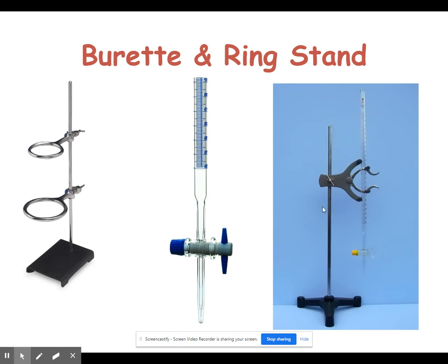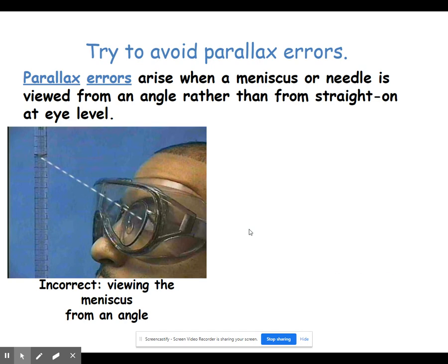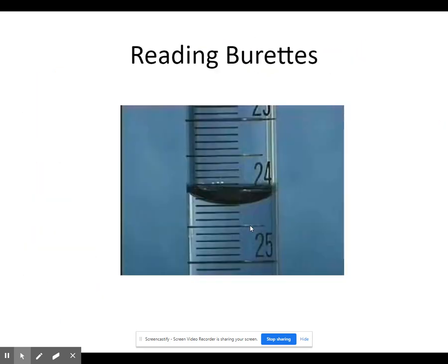The stand that holds the burette is called a ring stand if it has a ring on it. One important thing about reading a burette: the markings on a burette start with zero at the top, and the numbers get higher as you go further down. This is the opposite of a graduated cylinder, where zero is at the bottom and numbers get larger as you go up. With a graduated cylinder, we're concerned with how much liquid we add; with a burette, we're concerned with how much we've released. So the numbers are backwards — be very careful about that when reading.